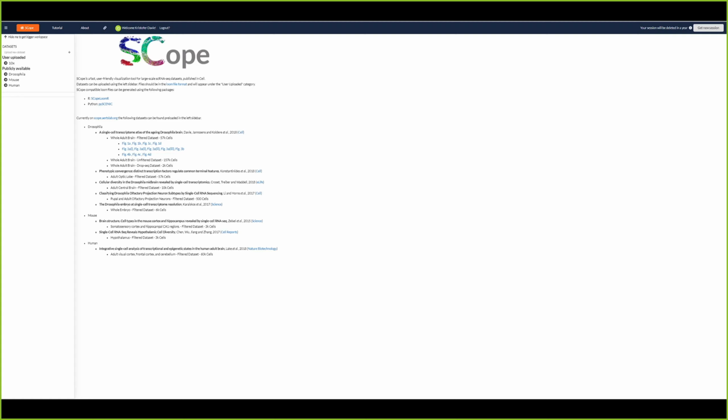And although some of you are going to know Scope, some of you may not know Scope, and given that it's going to be a really key place to go look at this data, the rest of the talk is going to be a set of demos to show you how you can use it, how you can leverage some of the functions to investigate the data.